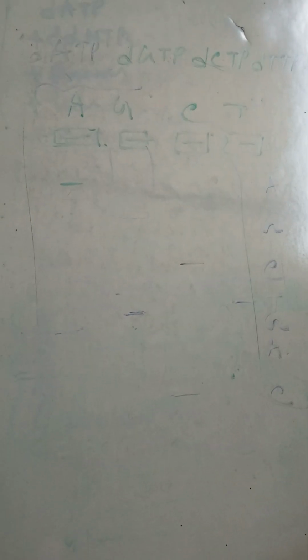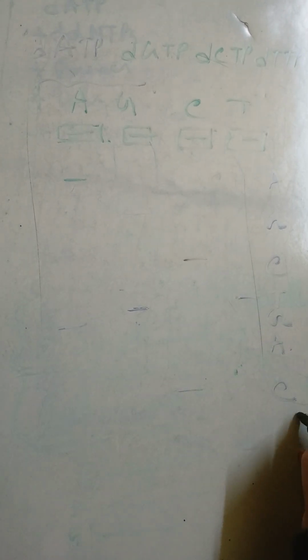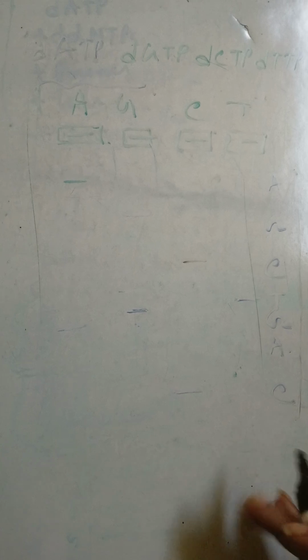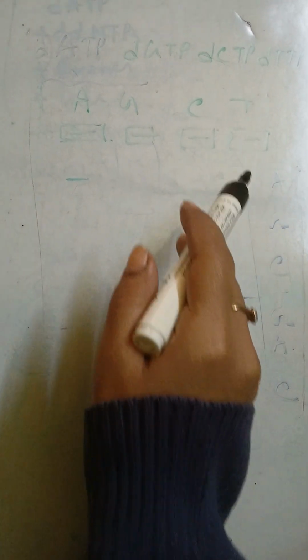Now this is how to read this sequence. What is the process of reading the sequence you will get at your gel? You will read the sequence from bottom to top, not top to bottom. You just have to read from end to start. So in general you would start like this: A G C G A C. No, it's not like that.